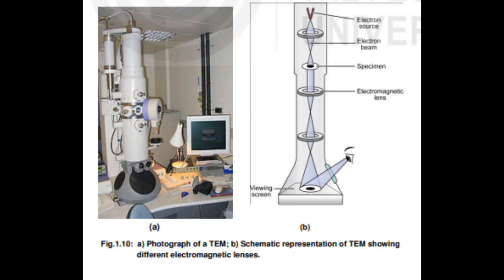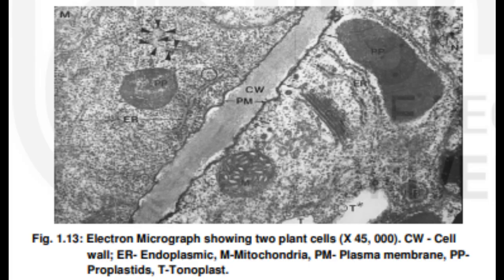In en bloc staining, a fixed biological specimen, block tissue, is immersed in an aqueous solution of uranyl acetate for several minutes, followed by aqueous lead citrate and or lead aspartate. This process enhances the image contrast of membrane structures or fibrous structures in cells.